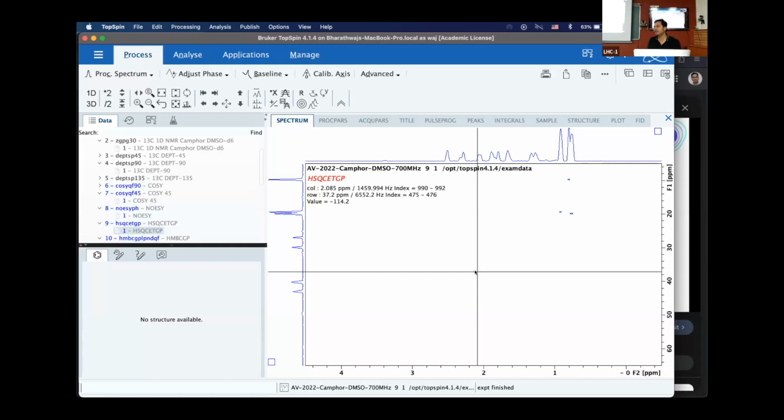Try to go revise, think about what was spoken, and then come back for tomorrow's class. Please solve without the 180-degree pulse, for the HSQC, in the middle of the T1 delay. One more assignment would be, do not change the 90-degree pulse in proton to orthogonal. Keep X and X and see what you get.